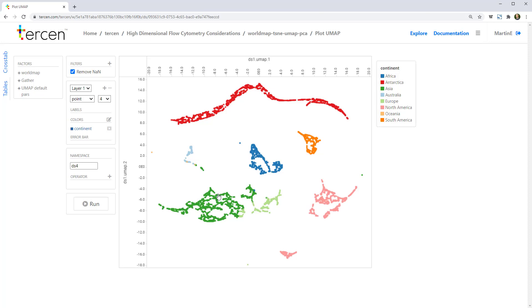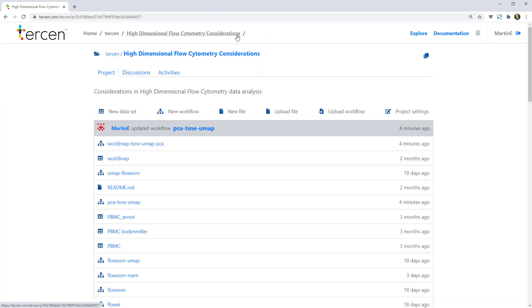Now let's take a look at how this works with cytometry data. For this workflow, we used the PBMC dataset from Kirsten Diggins' research in the Jonathan Irish lab at Vanderbilt University.